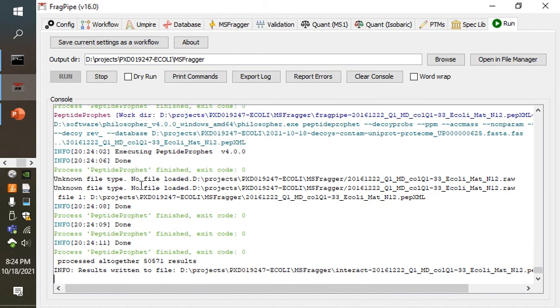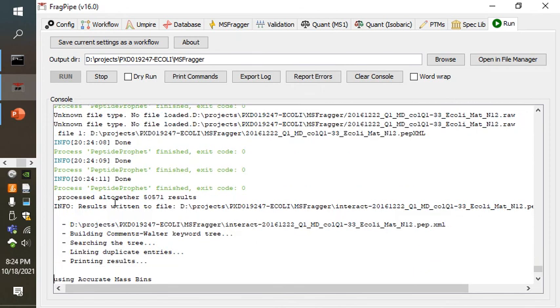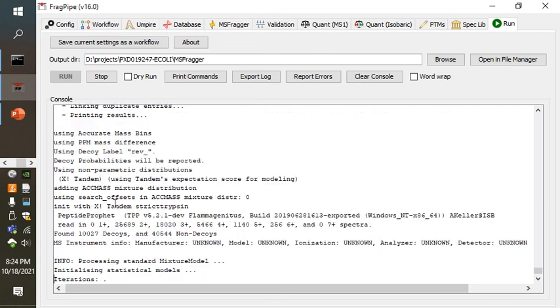You will see that occasionally the software throws odd little errors about unknown file type. Some of these features behave better if you do a search from mzML format instead of RAW, but generally speaking, that's not going to come into play for anything that we are doing.